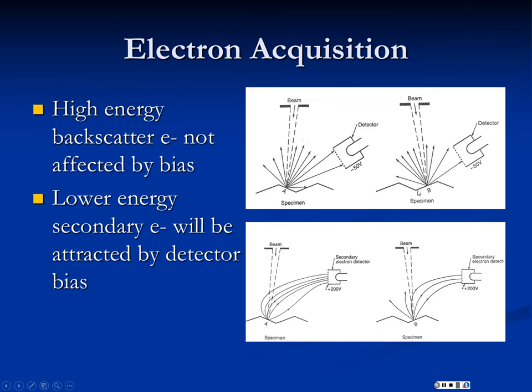But if the surface is sloped away from the detector, not much is going to bounce towards it. So we're going to get shadowing. And it's like shining a flashlight at the surface and standing off to the side. And if the stuff's reflected away, you don't see anything.